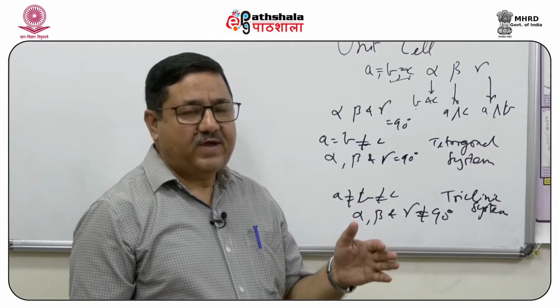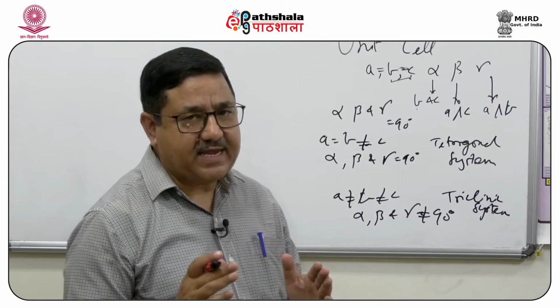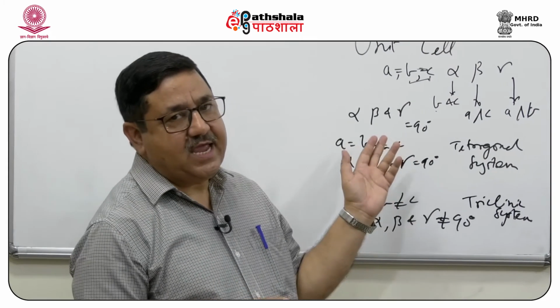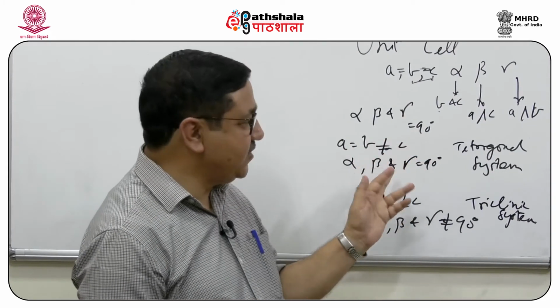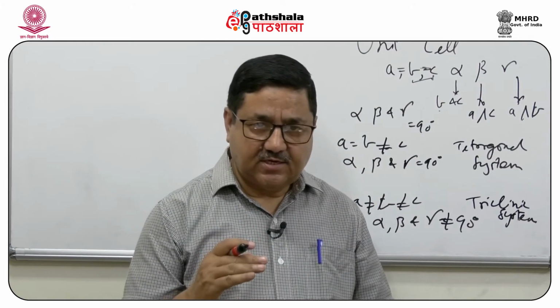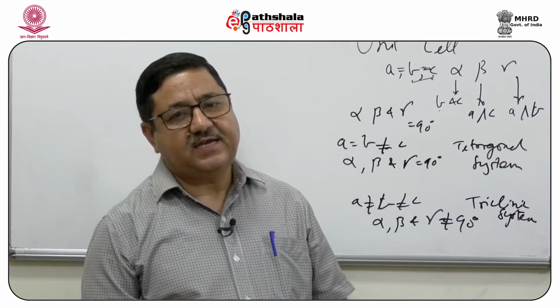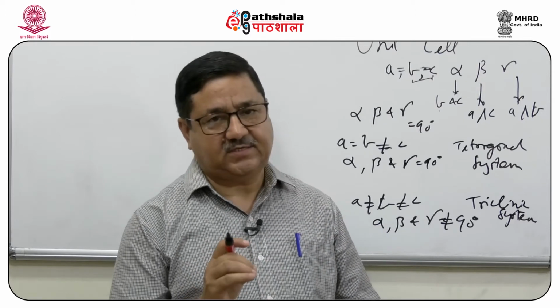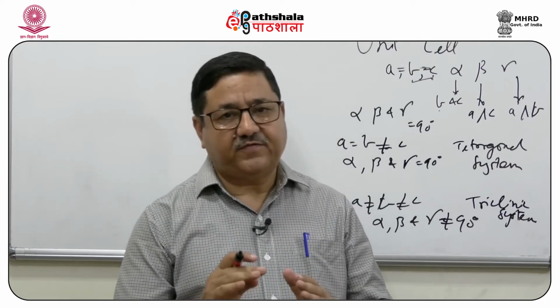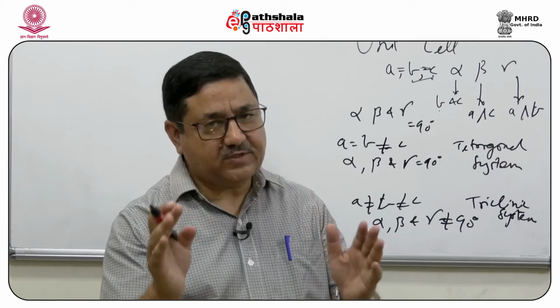So, when we use X-ray diffraction, we try to characterize this physical aspect of a crystal, with the aim of trying to know the unit cell. Now, this regular internal atomic arrangement can be defined in terms of lattice points, and a lattice point is representative of a similar environment for one particular lattice point throughout the space of a crystal.